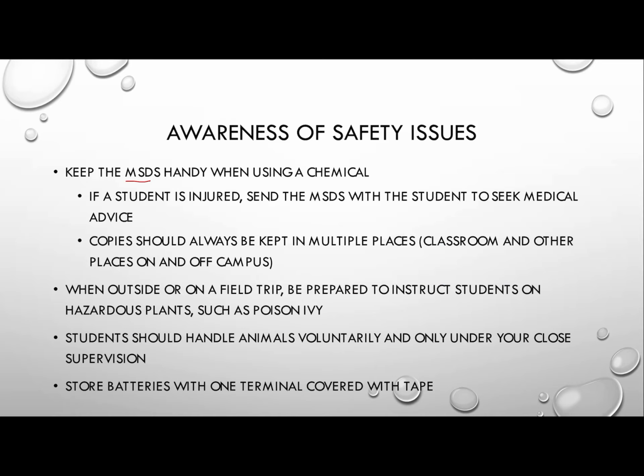Normally these are stored in binders. They should be in your classroom. They should be in your head teacher's classroom. They should be in the front office. And the reason why is if a student is injured, you're going to send the MSDS with the student to seek medical advice. If it's ingested, if it's skin contact in the eye, there are going to be recommendations in the MSDS on how to treat it right now.